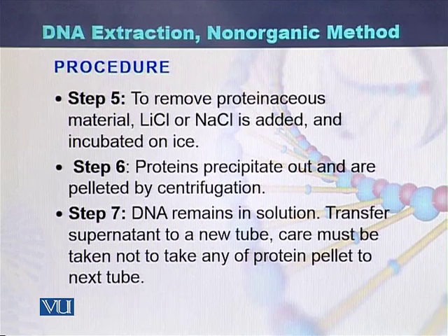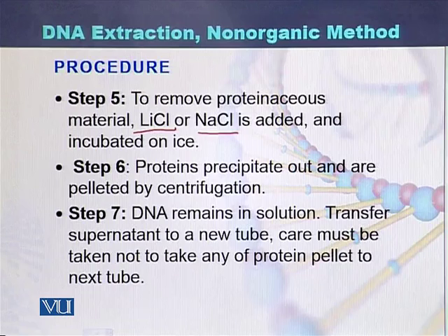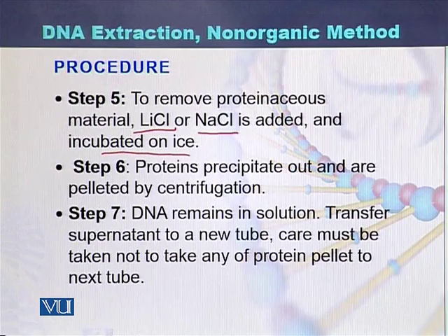During the next step, all those proteins which have been digested are removed from the DNA. Those proteins are removed with the help of a non-organic compound that can be lithium chloride or sodium chloride. Mostly a supersaturated solution of sodium chloride is used. The supersaturated solution is added to the digested proteins and it is incubated on ice for a few minutes.